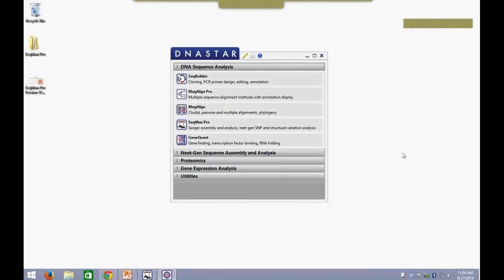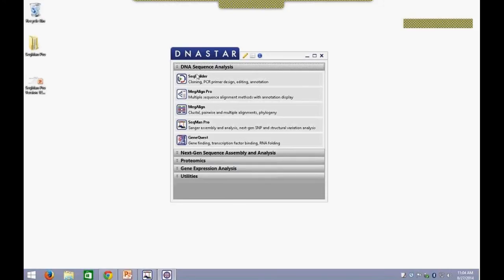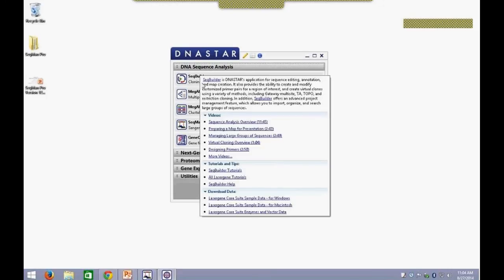I first like to start off with the DNASTAR Navigator. The DNASTAR Navigator is a hub that groups different programs into different categories so that the user can easily open the program and work with the workflows they're interested in. We have several sections: DNA Sequence Analysis, Next Generation Sequence Assembly Analysis, Proteomics, Gene Expression, and Utilities. If you hover over any one of these programs, you'll get a summary of what the program can do, as well as quick tutorial links to common videos. We have over 100 videos on our webpage.